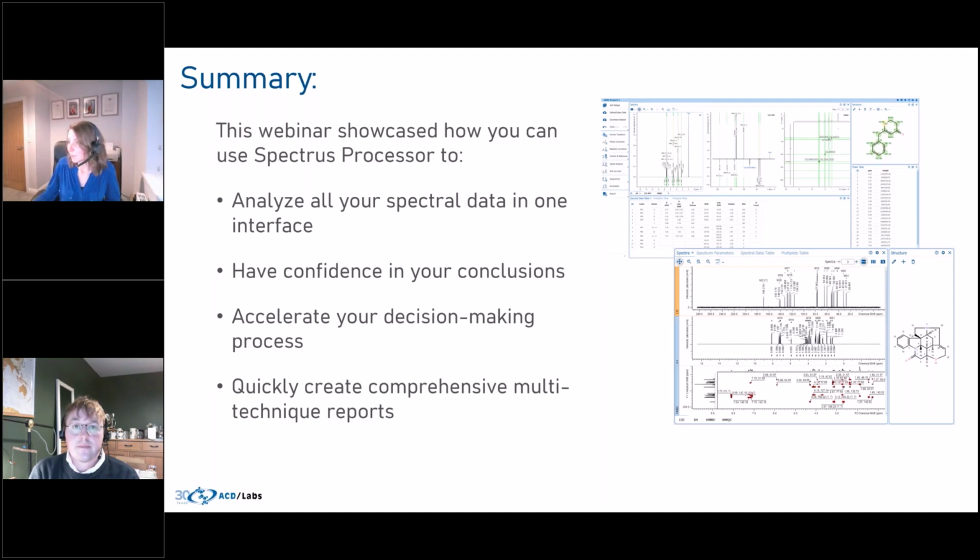Someone's asked for the browser-based Processor: where are the data files stored? Is it locally, on the cloud, or somewhere else? For the browser-based, it's stored in your own company system. So we don't host anything. The setup can vary from installation to installation, but it's saved within the company that has purchased and installed Processor.js.